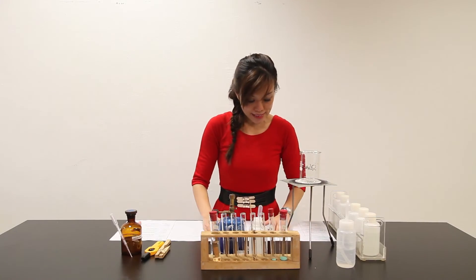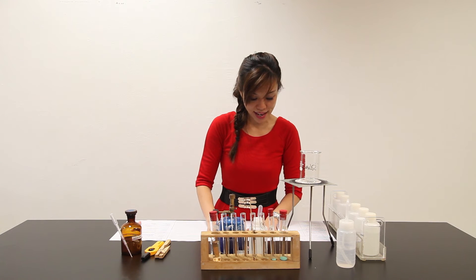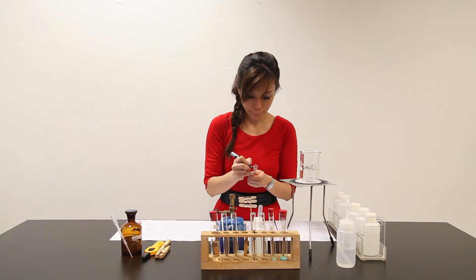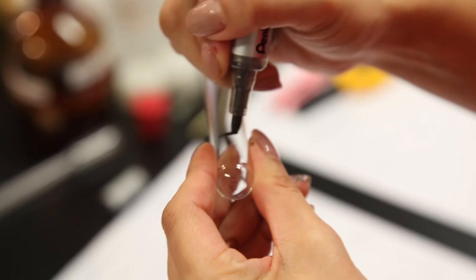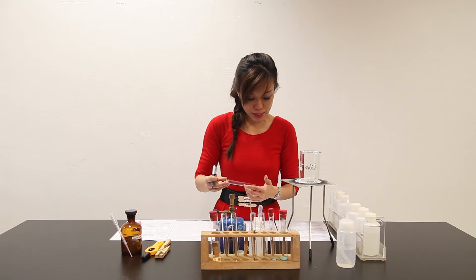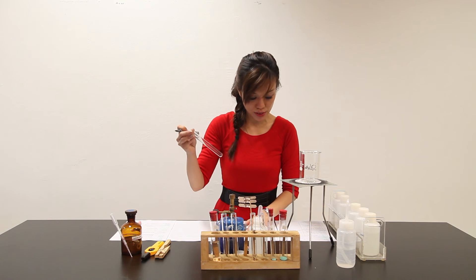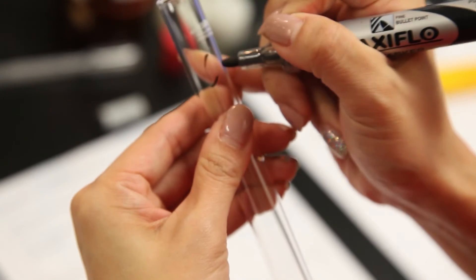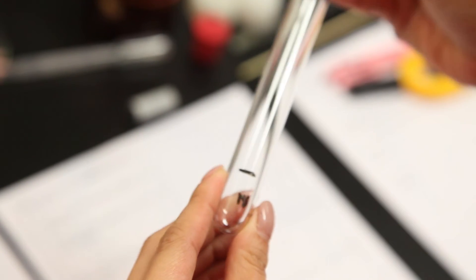Part D: place about 2 cm³ of Solution Z in a clean test tube — this is Part D, 2 cm³ of Z. Place 3 pieces of magnesium ribbon into this test tube, and you will need to observe this test tube for a few minutes. I am going to place some magnesium strip inside, so let me place it here first.